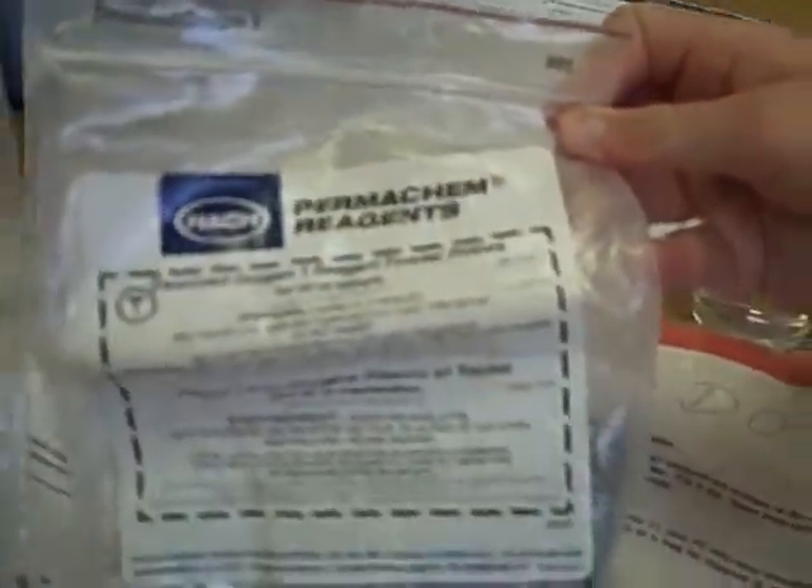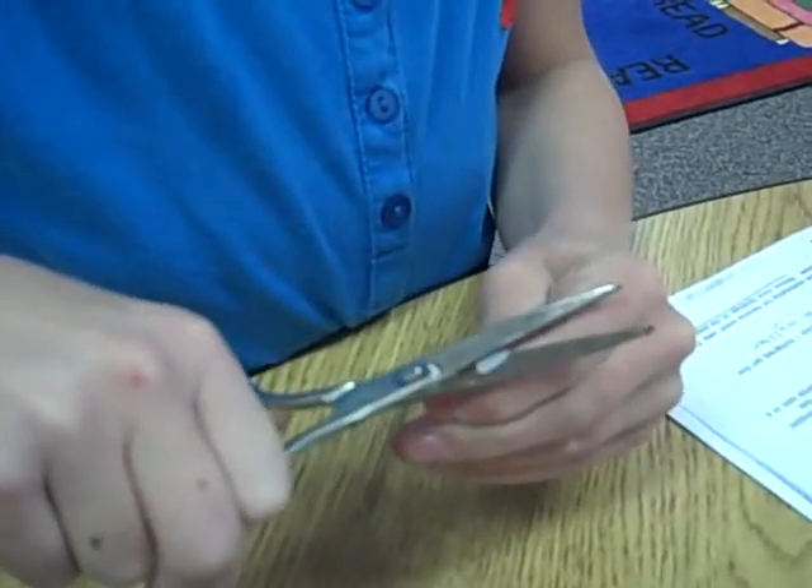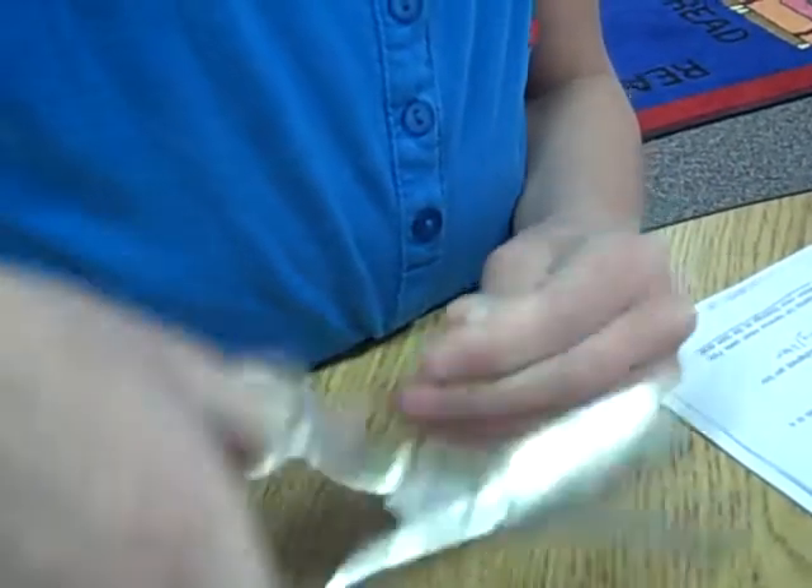Next we're going to add the pillow packets. You need pillow packets one and two. I'm going to cut powder pillow one and put it in the water, then cut powder pillow two and pour it in the water.